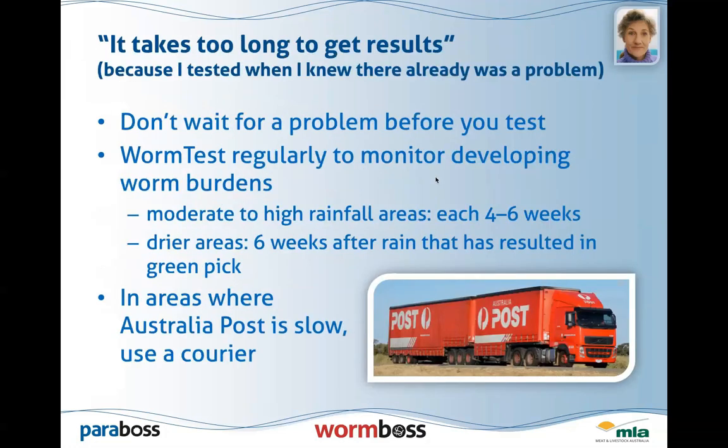What about if you think it takes too long to get results? Well, the worm egg count results are generally sent back within 24 hours of the lab receiving your samples. It does take longer for a larval culture because the incubation period is 7 days.